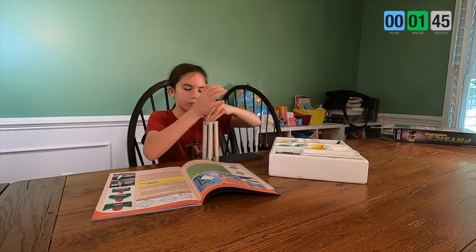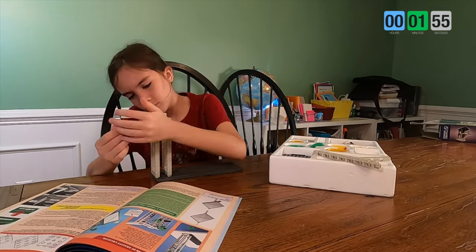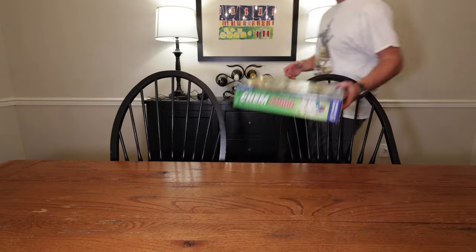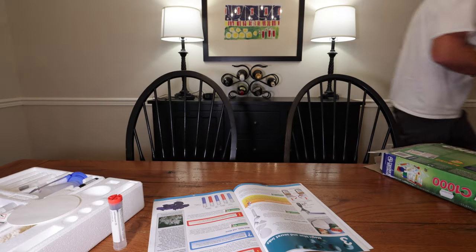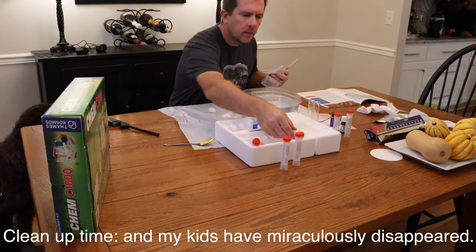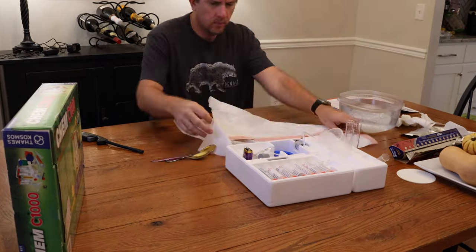Of course, nothing is perfect, so let's talk about the negatives. One drawback is these kits take way more setup time than your average physics kit. With a physics kit you can just open it up, start putting things together, and it works fine. With some of these experiments, the first step is actually making a solution and letting it sit overnight before you can continue. It takes quite a bit of pre-planning. Also, unlike a physics kit that you can bag up and store, chemistry kits require that you do them in an area you don't care if it gets dirty, and there's a lot of cleanup time afterwards — cleaning up all the glassware and disposing of chemicals.